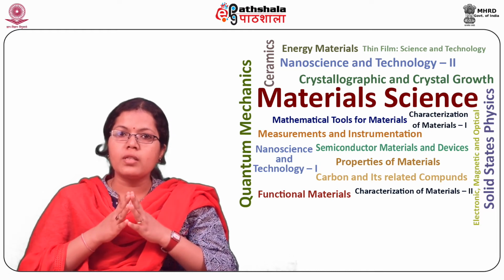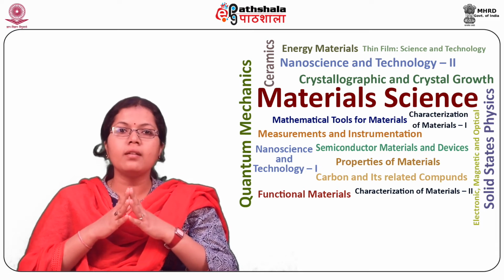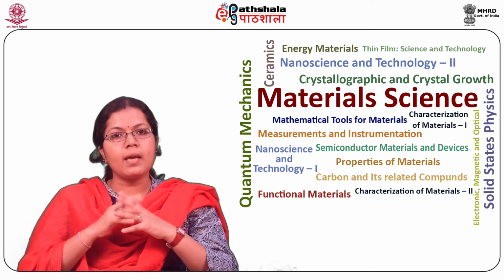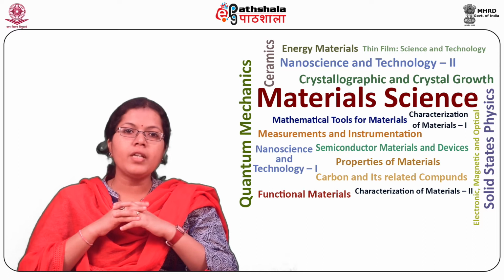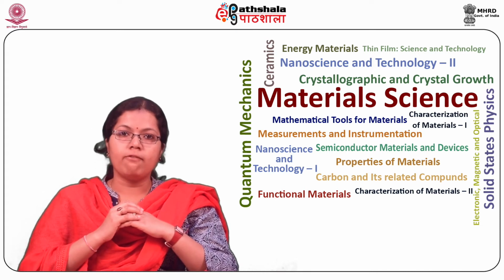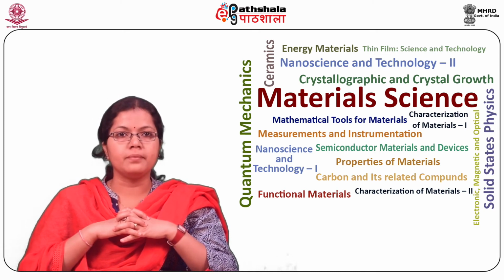As electrons are absorbed easily in thick samples, that is, where the thickness is more than 1 micrometer, the transmitted electrons are observed only in thin samples. A study of the signals emitted on the top surface forms the basis of scanning electron microscopy, while transmitted electrons are used in the transmission electron microscopy.